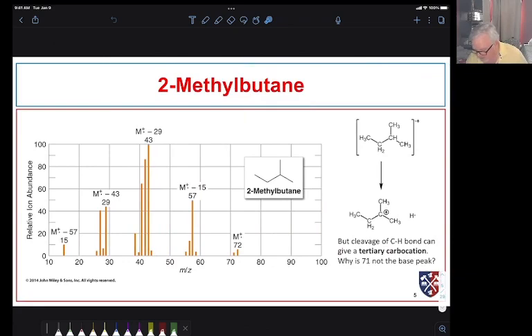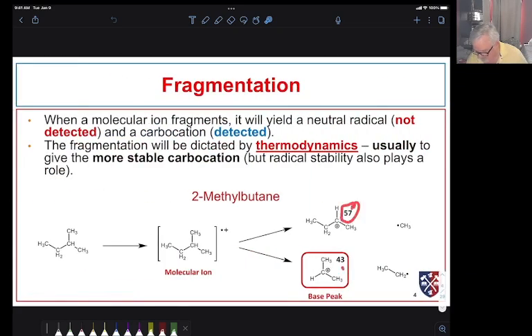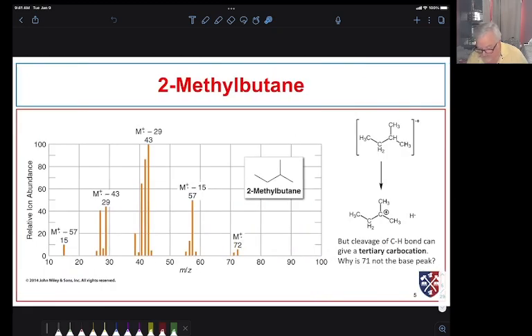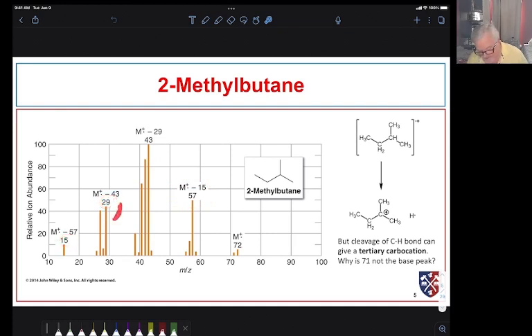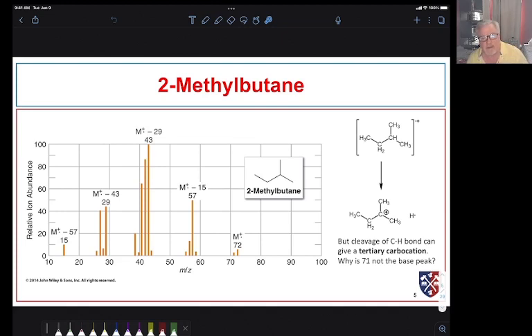Looking at the spectrum, we're looking for peaks at 57 and 43. Our base peak is at 43 and another significant peak is at 57. We also see the ethyl cation and methyl cation — the ethyl cation gives a significant peak. Notice how small the molecular ion peak at 72 is, which tells us we have some relatively weak carbon–carbon bonds and this molecule fragments fairly readily.